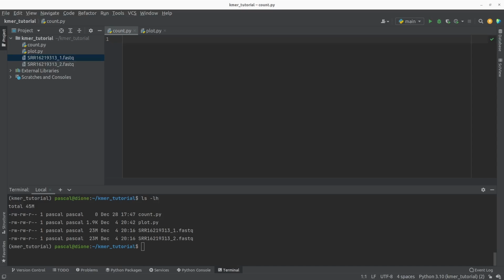Hello everyone, welcome to k-mer analysis with Python. This is the second video in the series, and today we are going to be counting k-mers from raw data that I just downloaded from NCBI.